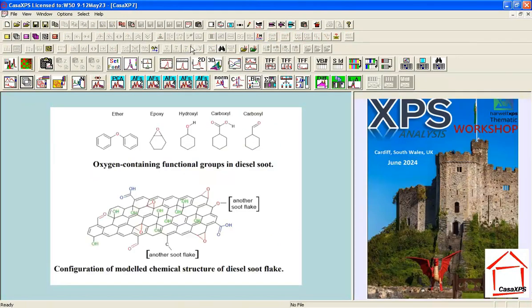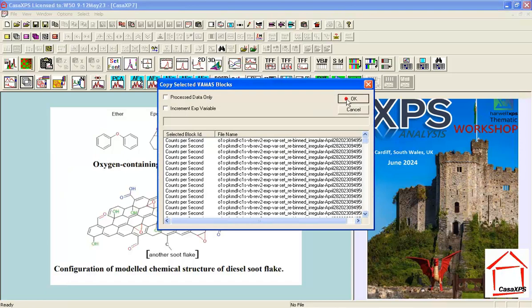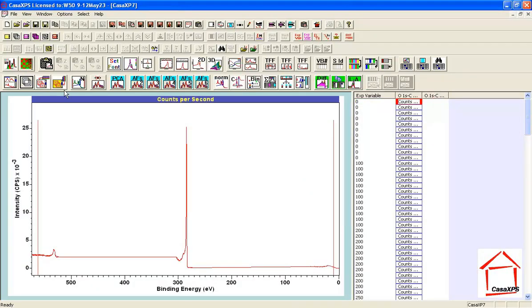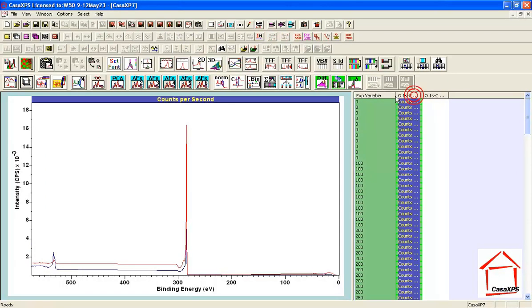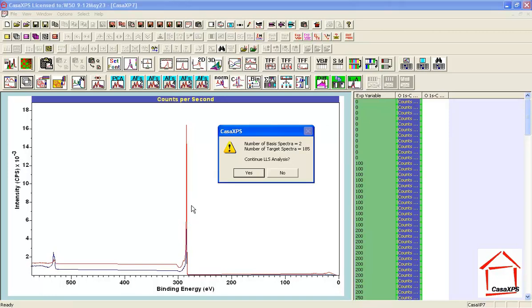Since I chose two spectra and formed difference spectra, I've transformed those two spectra into new shapes that might be more interesting in a physical sense. Comparing these two calculated components overlaid, it actually looks like something interesting — it appears we've got an initial state with some oxygen, and over the range of different temperatures, oxidation has occurred in the carbon. Let's do a test of these two shapes against the raw data, performing a linear analysis.